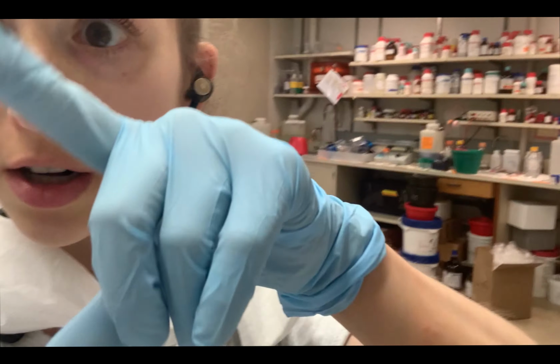So basically, after we do these, we put these filter papers and we're going to wash them and wash them and wash them. We wash them in phosphoric acid, which I'll tell you more about later. The special thing about this paper is it's phosphocellulose paper. The phosphate groups we talked about are negatively charged. So you have negatively charged groups on this paper and in the ATP, and the ATP won't bind the paper because they're both negative.